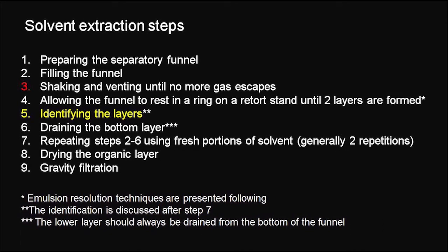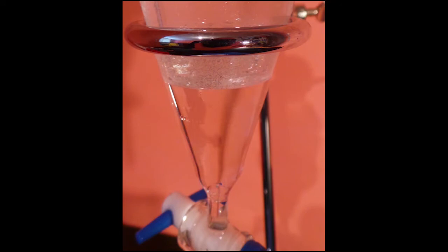And then the funnel should not be shaken too vigorously because it may cause formation of emulsion. An emulsion is the dispersion of droplets in an immiscible liquid.